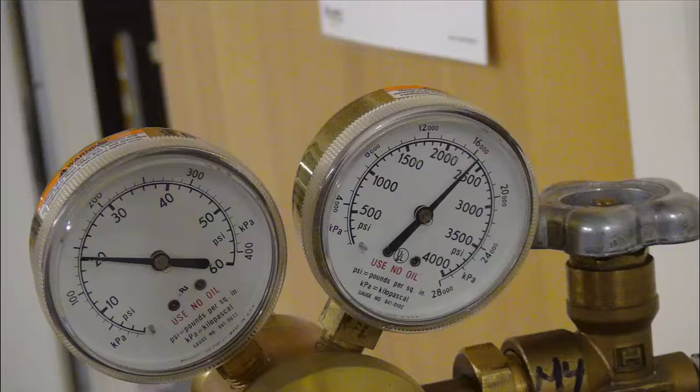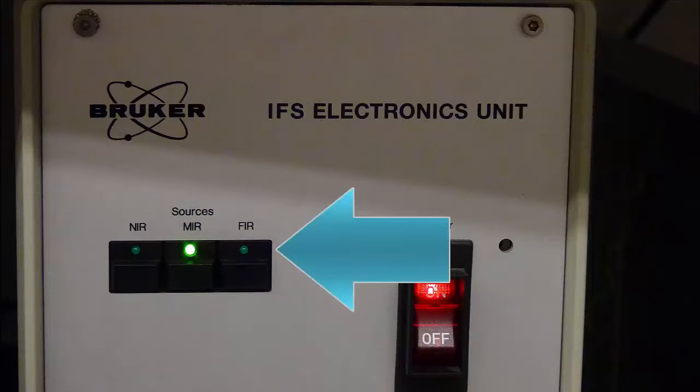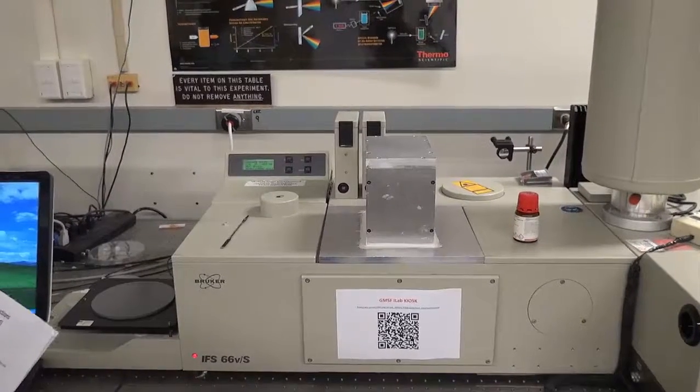You need to check the nitrogen cylinder to make sure it's not empty. You need to check that the correct source is installed and on. You can do this by looking at the box underneath the table. You need to check that the correct beam splitter is installed.